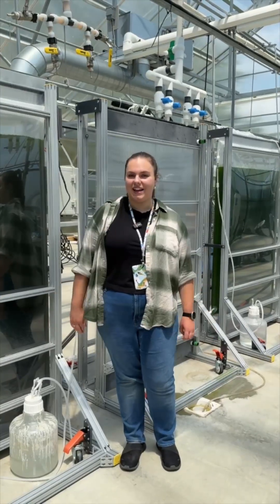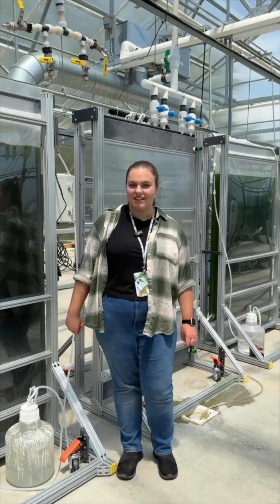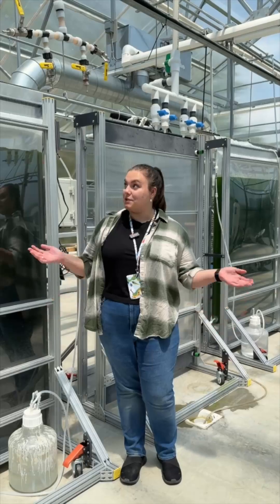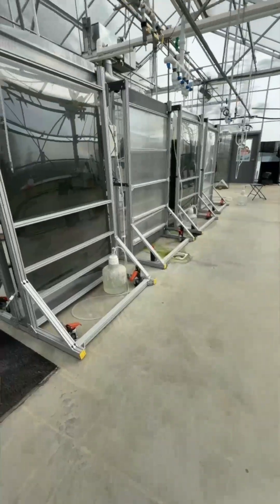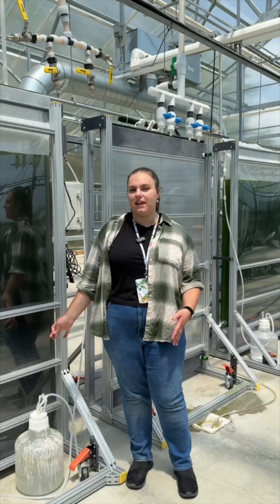My name is Lydia. I work at Bigelow Labs. I am a research technician in the National Center for Marine Algae and Microbiota, and I do a lot of work here in the greenhouse. What we'll be talking about today is our harvest for the Algae Foundation.